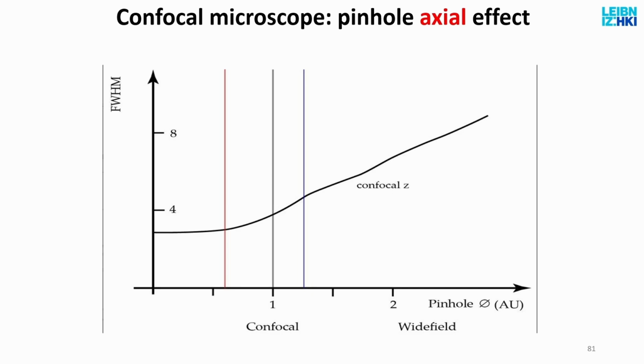There are, of course, many other modalities for microscopy. Spinning disk confocal microscopy, where you use multiple pinholes and you don't have so much control over the pixel size, and super resolution techniques. But for these, we don't have time because of the 3-hour limit. But in your practical life, the images that you deal with will mostly be from fluorescence and confocal microscopy. I thought this would be very important to understand how these systems work. And then based on that, you can extrapolate your knowledge and read up on how various modalities work.